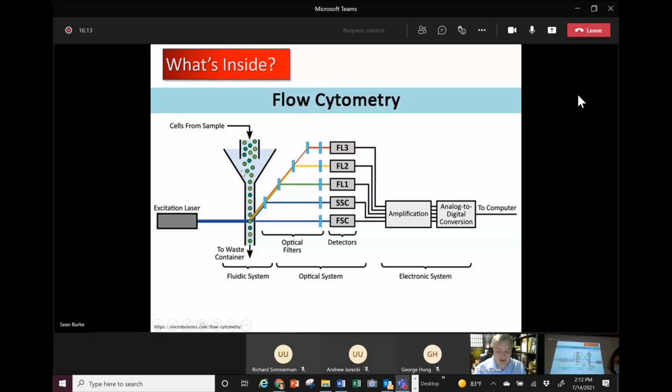And I think the really cool thing about flow cytometry in general, which you can see here, is that there are so many sciences involved in this, right? We have chemistry for putting together chemicals and antibody combinations, we have biology from the cells themselves, we have fluidic systems, we have physics and optics, we have electronics, right? So these instruments are really rather complex. They can be simplified into little handheld tools, which are really, really great. But the more complex and the more markers you get, these things can get very complex.